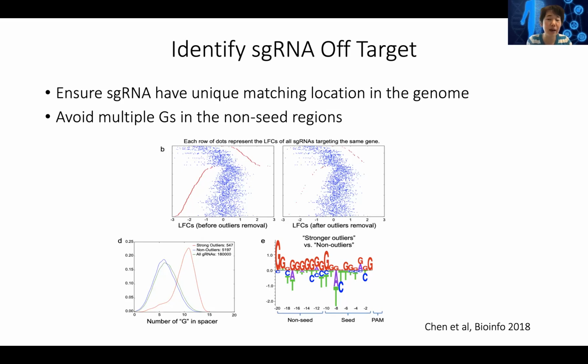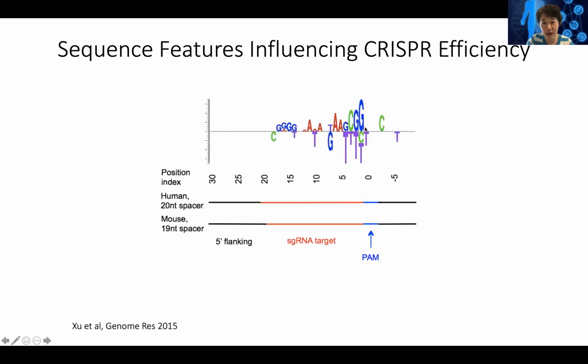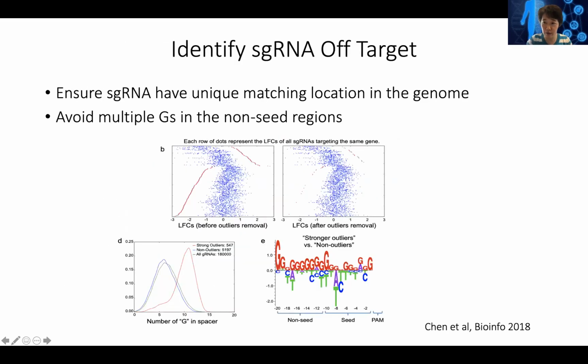But because there are so many CG regions in the genome, if it goes to hundreds of CpG islands and each location makes a small percentage of cut, you still create a lot of cuts in the genome, which is harmful for the cell. And so in some sense, you want to create the correct sequence that might have some favoring of G positions, but you don't want to have too many Gs in the guide, which might create off-target cutting.